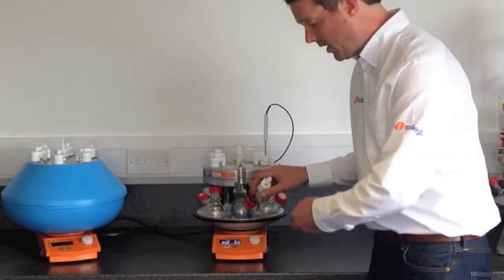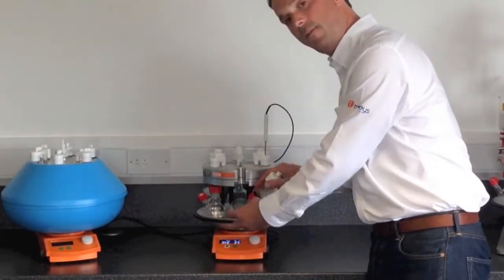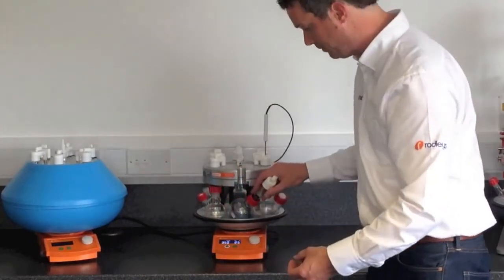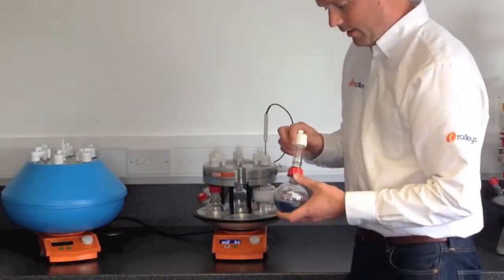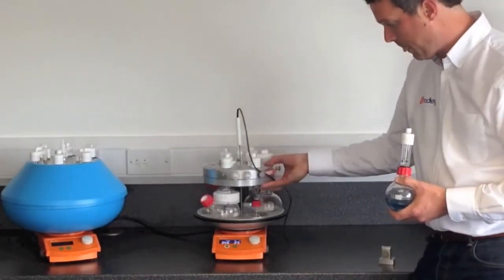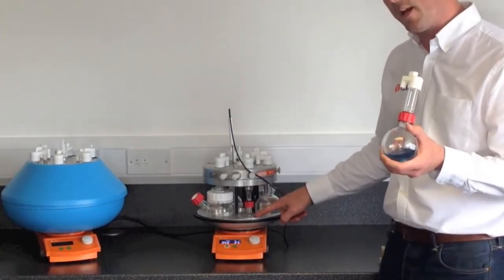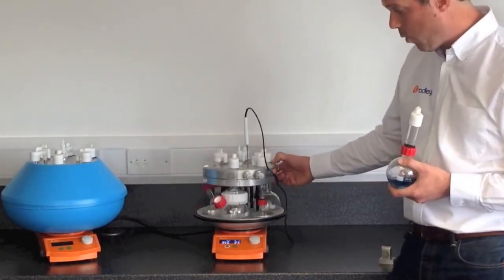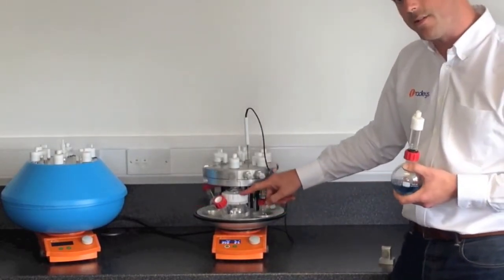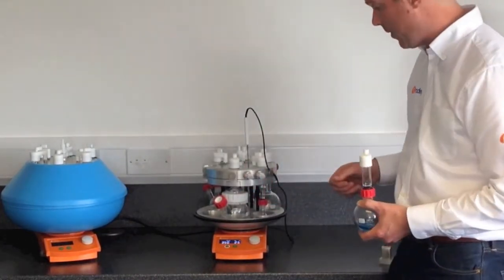The glass vessel is also custom made to be a really good fit in the block, so the heat is transferred very efficiently through to your solution. There are lots of different types of glass flask, from 5ml — which is here using the insert — up to 250ml. We have wide-neck flasks that allow you to get a large stirrer or a spatula into the top at the end of the experiment.